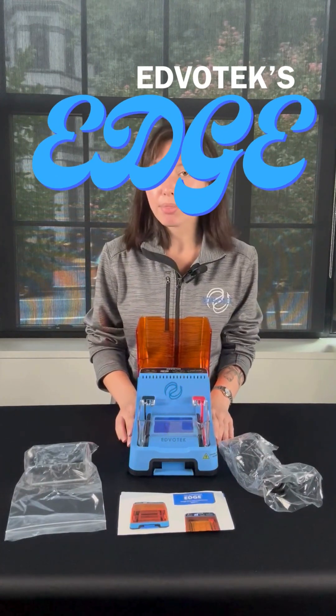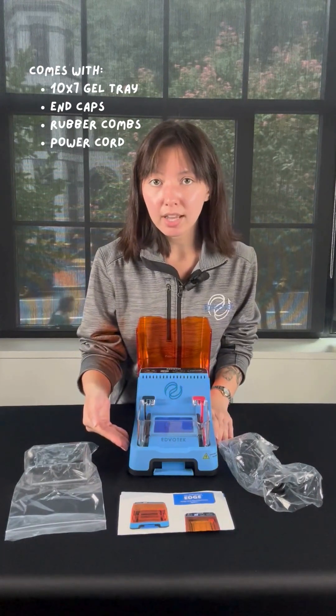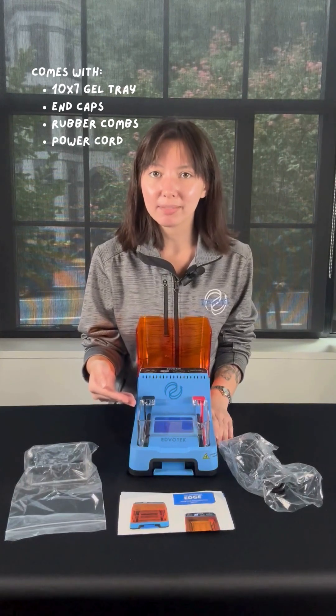This is Edvotec's Edge, which is a 3-in-1 integrated electrophoresis system that comes with a built-in power supply, a blue light so you can visualize your DNA, and a chamber so you can run your DNA samples on it.